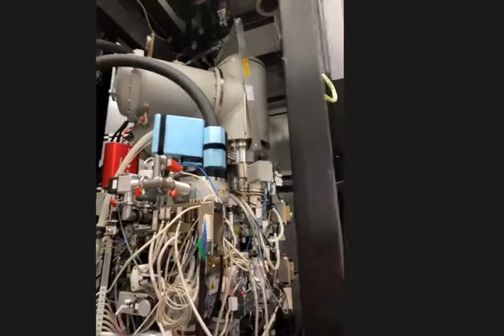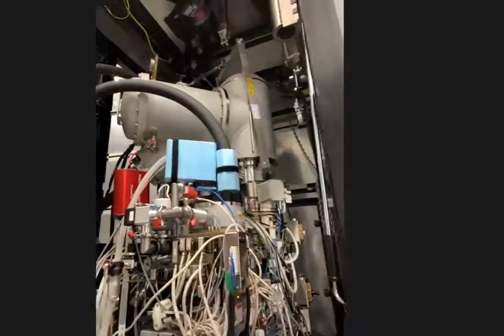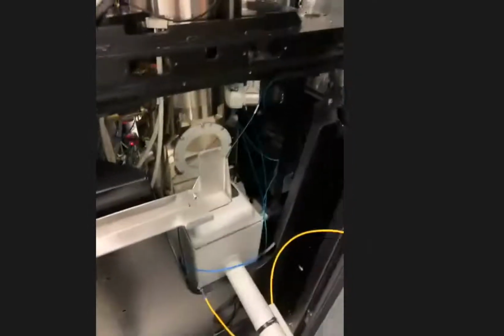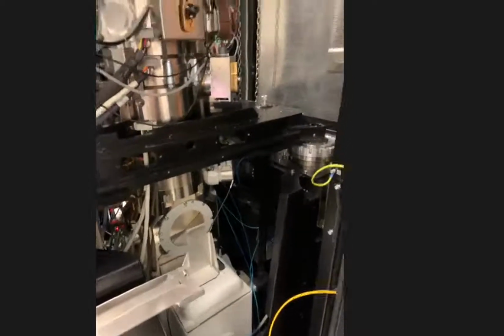Right, okay. So what we've got at the top here, which you can see where I'm pointing, is the electron source, a 300 kiloelectron volt electron beam. That then comes down through this column that you can see. And what you're seeing here are the various different lenses. So the condenser, the objective, which is here, and then looking down, you get the projection lenses that then magnify the sample.